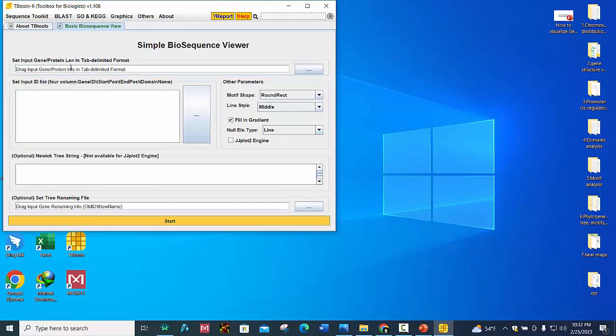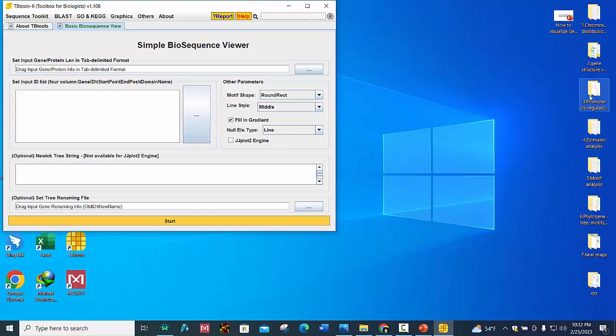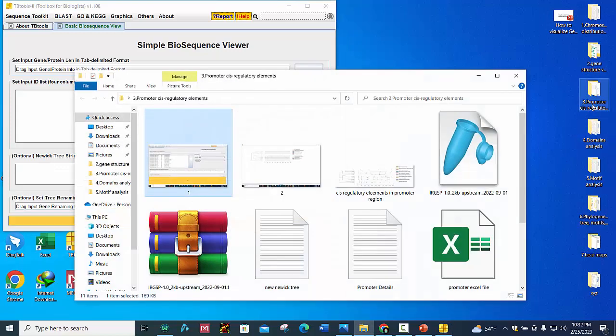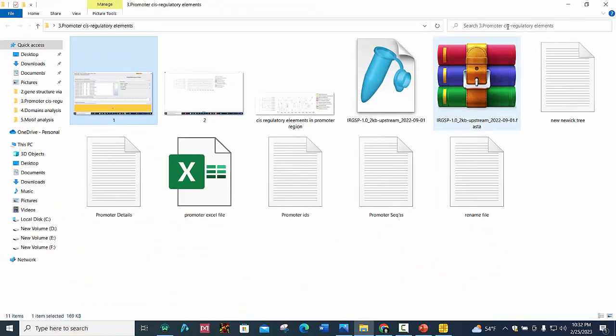First is gene in tab delimited form, second is set input ID list, and third is Newick tree. So we will place these files one by one.